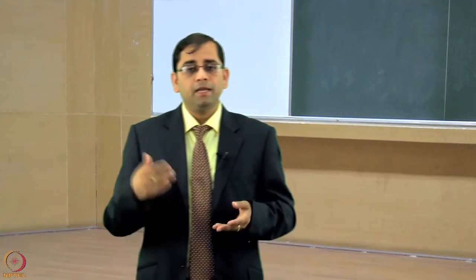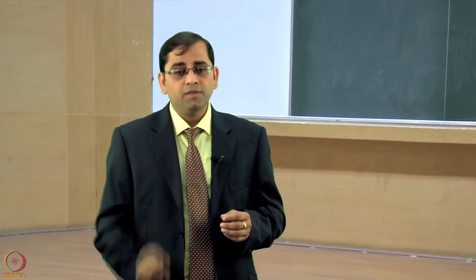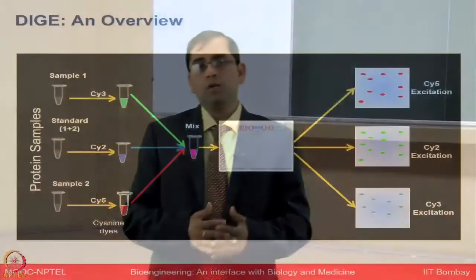The variability which is part of the experiment on biological samples, that of course, we cannot avoid, which is biological variation, but the technical variations and analysis-based variations have been quite a bit eliminated at the level of the DIGE technology and the software which has come forward to analyze this kind of data, and very robust statistics can be utilized to now identify these spots of interest, which could be taken forward with much higher confidence.